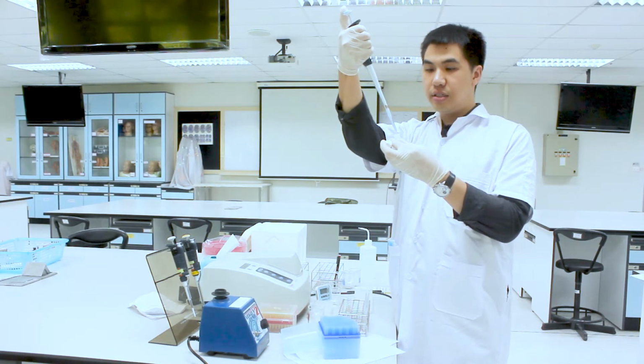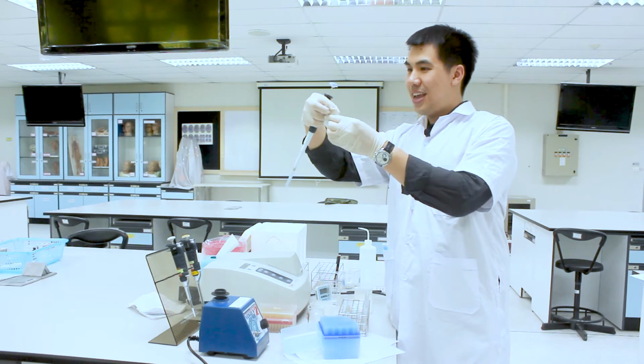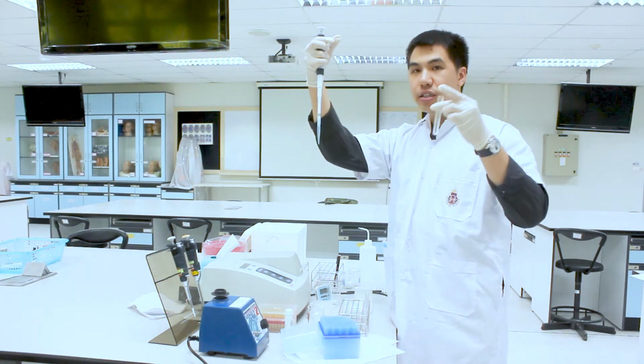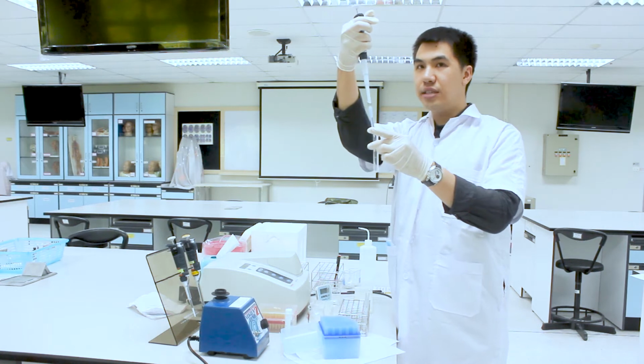Now the solution is already in the tip of the pipette. You add the solution into the test tube, but not into the center.